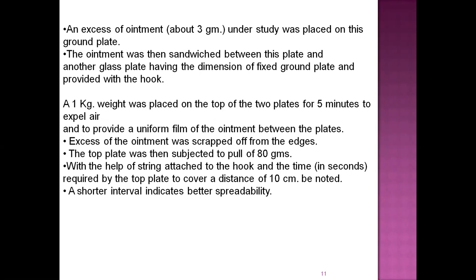Then about 3 grams of the ointment under study should be placed on this ground plate. The ointment should be sandwiched between this plate and another glass plate having the dimension of the fixed ground plate and provided with a hook. A 1 kg weight was placed on top of the 2 plates for 5 minutes to expel the air and to provide uniform filling of the ointment between the plates. Then the excess ointment coming out was scraped off from the edges.